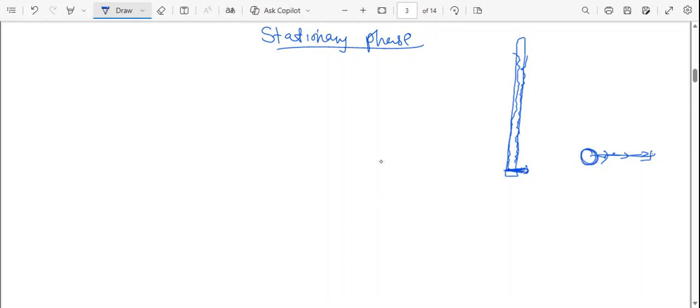So that's what actually happens in the mobile and stationary phase. Particles will be moving, and what makes them move is capillary action. The stationary phase has thin holes where the solvent can penetrate and reach the highest point so that they can separate. Those with a high elution rate will move faster and reach the destination.